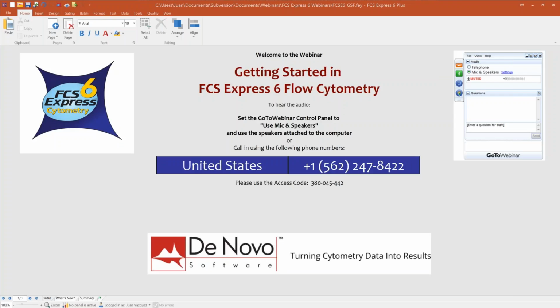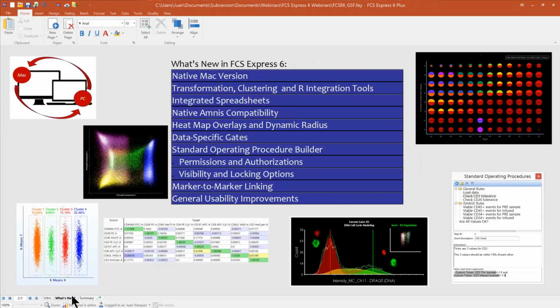Okay, so today's webinar is going to focus mostly on getting started in FCS Express 6. We do have a number of new features, and I'm going to touch upon a few of those new features. I won't be able to go into great depth about a lot of these new features. We'll have webinars that are specific for many of these new features on their own, but I will discuss some of them in some detail as to how we can use them and what they do specifically and what's new to FCS Express 6.